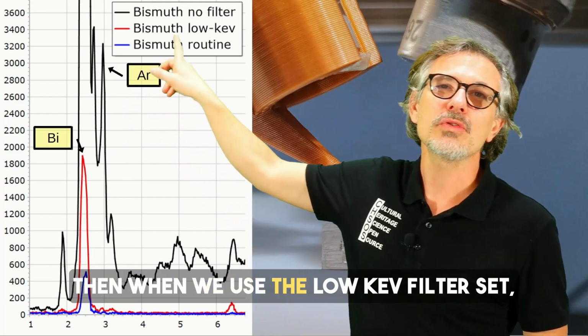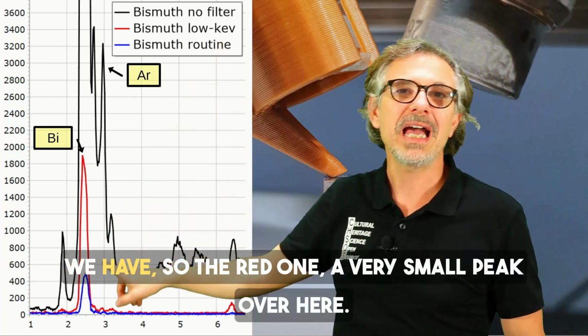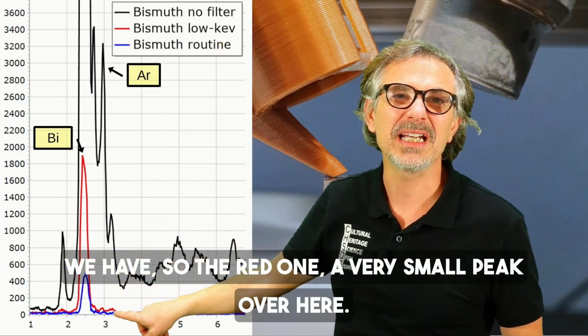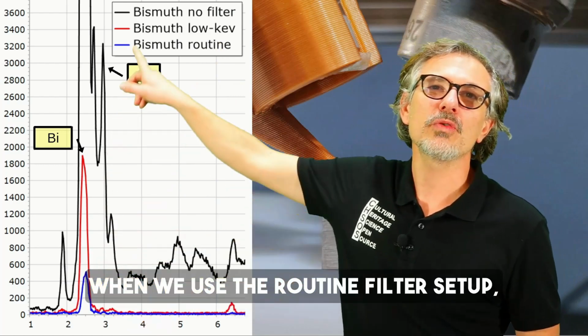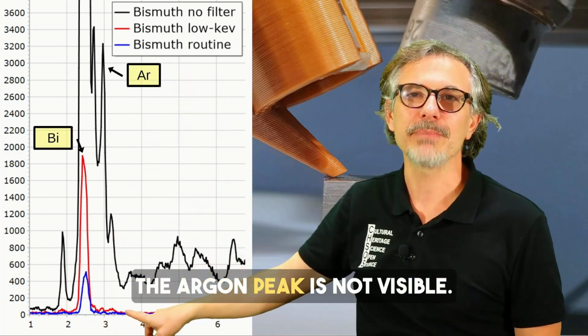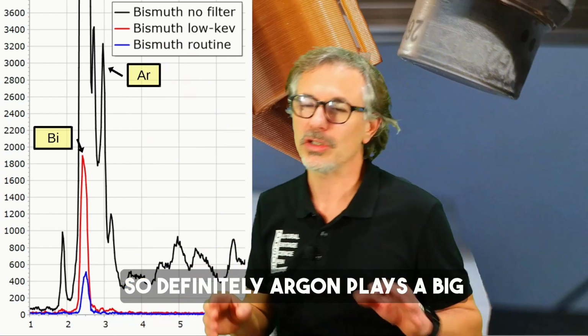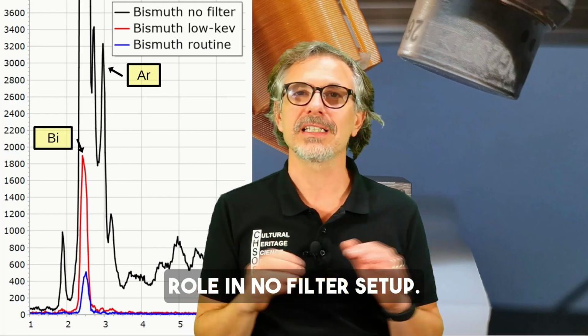Then with the low keV filter setup, the red one, a very small peak over here. When we use the routine filter setup, the argon peak is not visible. So definitely argon plays a big role in the no filter setup.